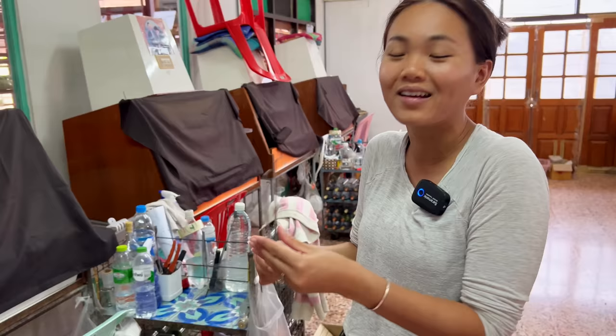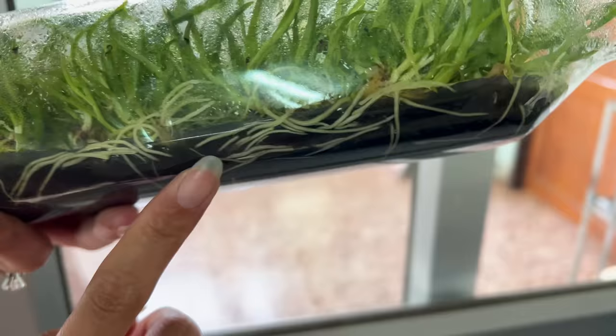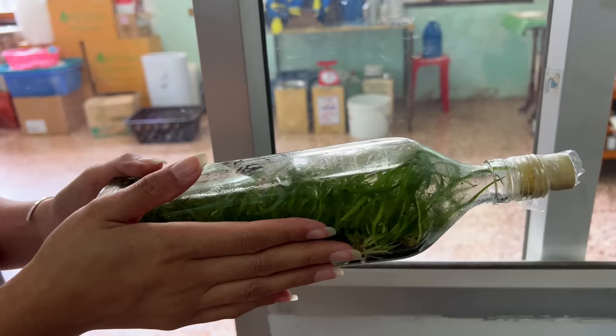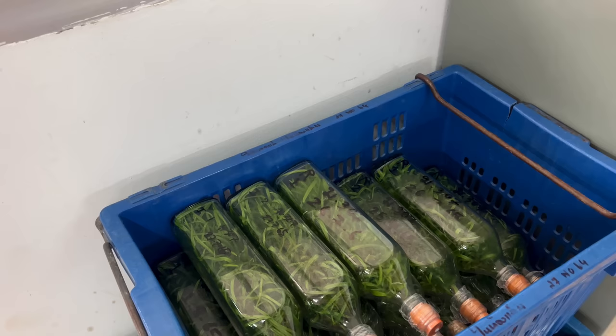Reach out to Nan if you want one of those. You can see it's outgrowing — the media is about to be gone. My employees are going to come in and start separating them, put them in the next bottle. For orchids, it's usually 40 plants per bottle. Half of them might die, but you can give the rest to friends or family.